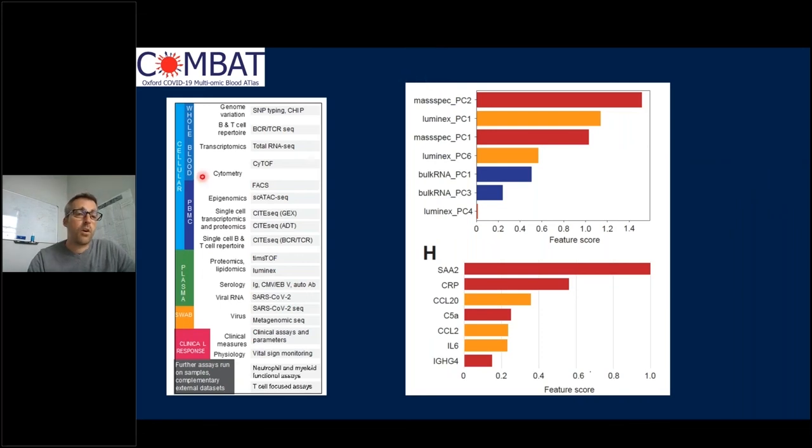So we employed in the consortium all these different omics technologies. So with proteomics, and the timsTOF. This is just this line here, but there were lots of other things that were done on the same set of samples. So we basically generated a huge multi-omic data set, for which at this kind of scale there's actually no golden rule how to integrate the data.